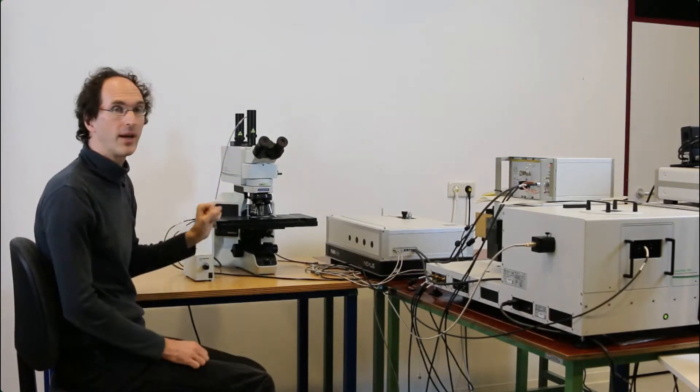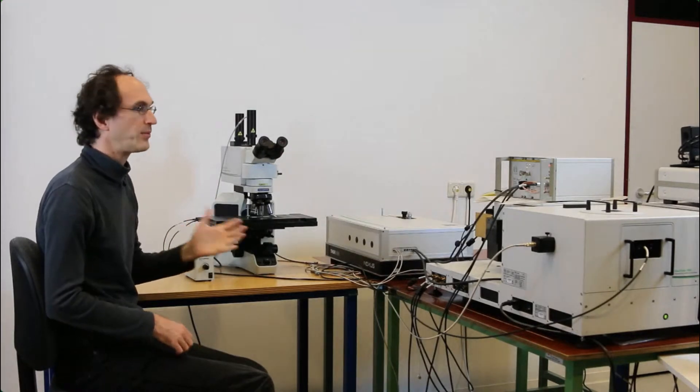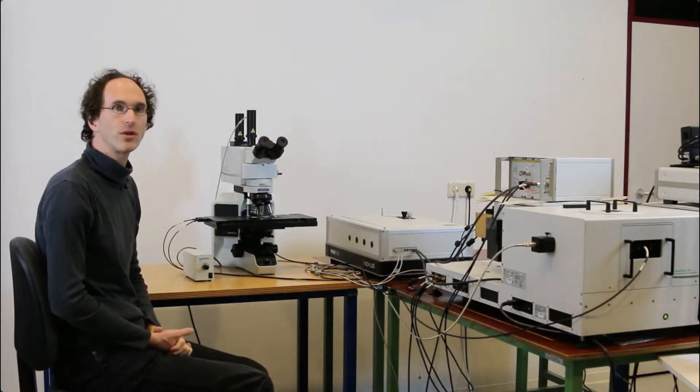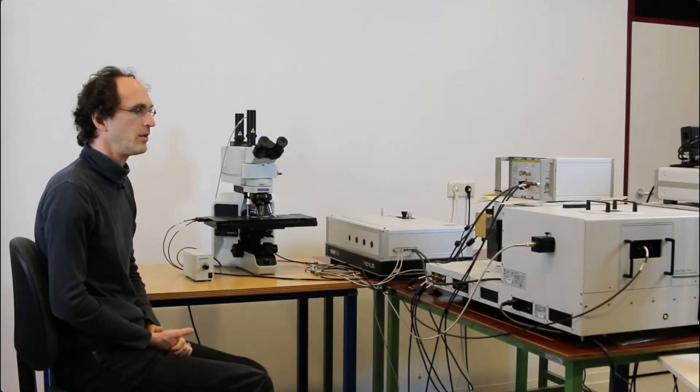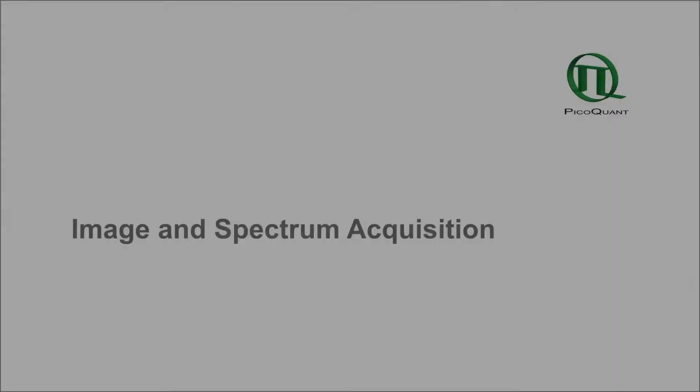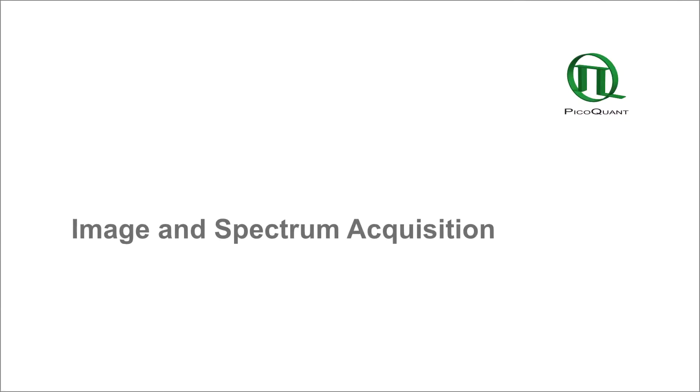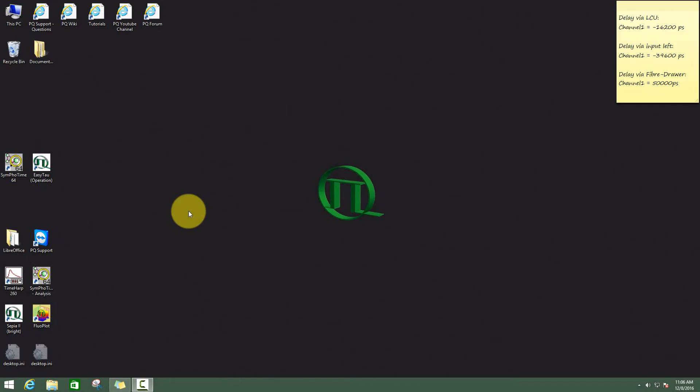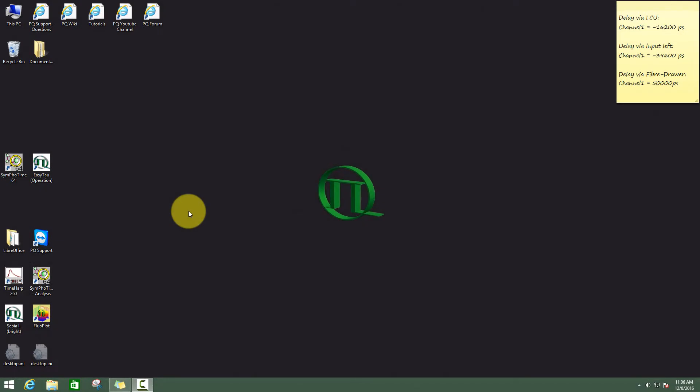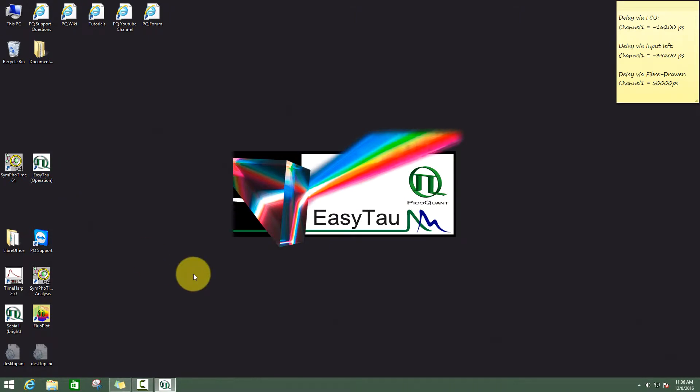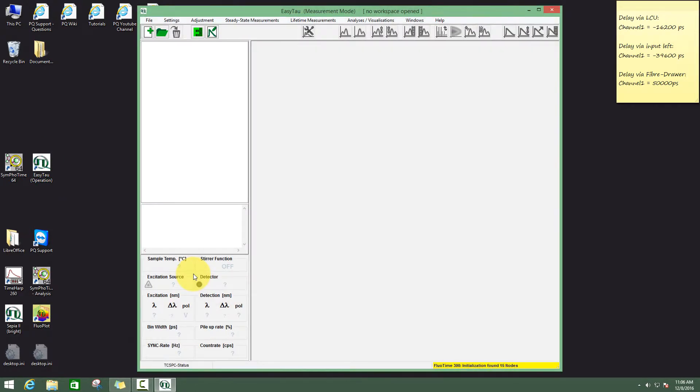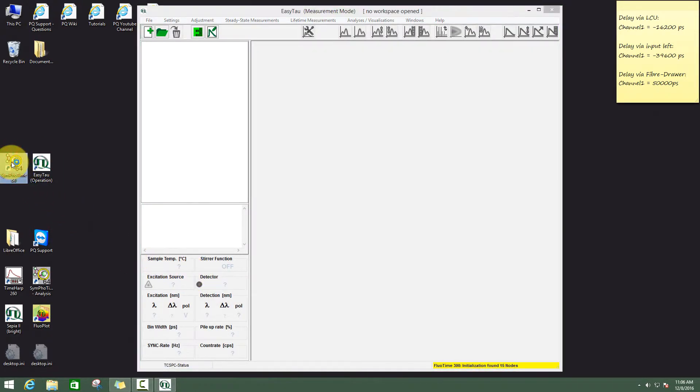Now everything is prepared here and we can actually do the measurement in the SymfoTime software. Now I have placed a sample on the stage and to measure it, we need to operate the EasyTau as well as the SymfoTime software. So I start both.